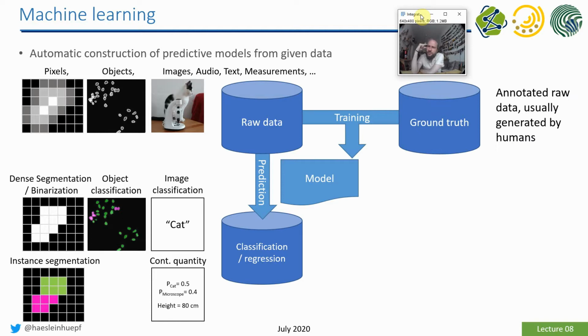In a typical use case for machine learning in microscopy image analysis, it's important that we have some ground truth information to guide the algorithm while training, so that it does the right thing. Somebody has to sit there and outline or segment objects and save them in a certain file format, so that we can later run a computer overnight and figure out the right parameters, the right model in fact, to reproduce this ground truth annotation on different images, for example.